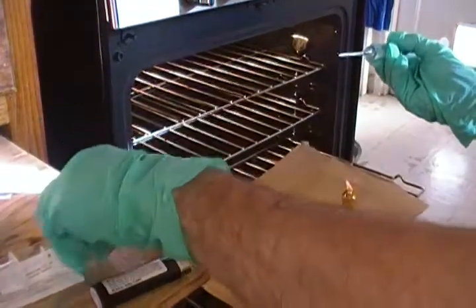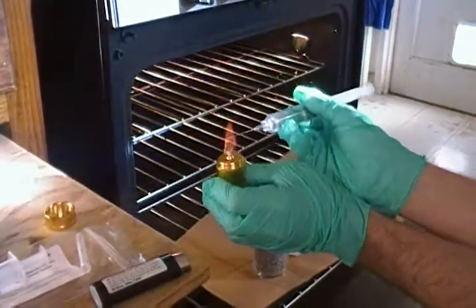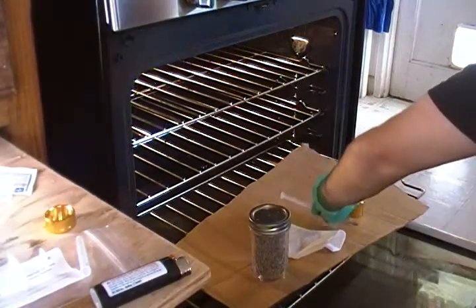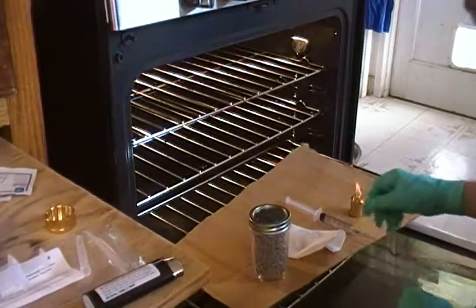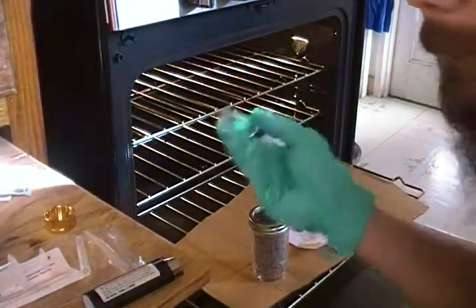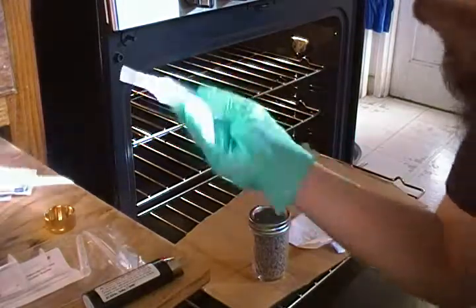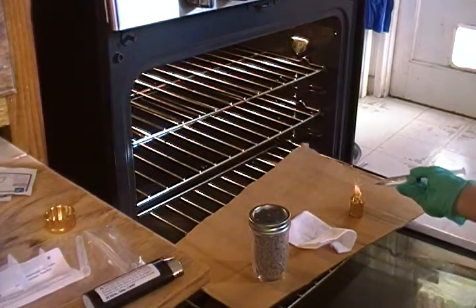Take off the needle cap and flame the needle until it's nice and hot — until it's glowing red. Then let it cool down for about three seconds. You can put some alcohol on it to speed that up. If you don't let it cool down, you're going to burn your substrate and possibly the spores. Very important: sterilize the needle and let it cool down properly, or you won't have any mycelium growth.